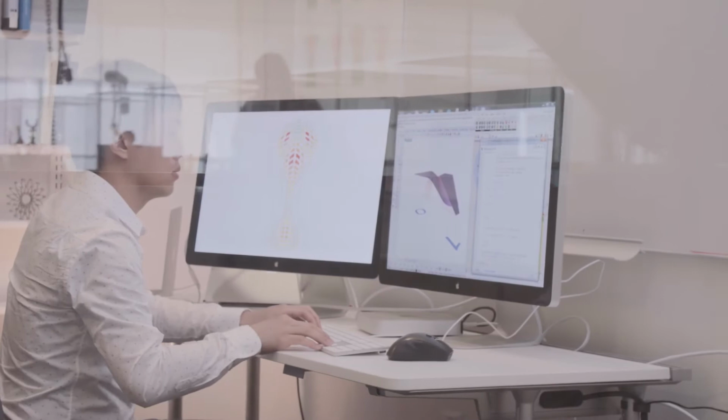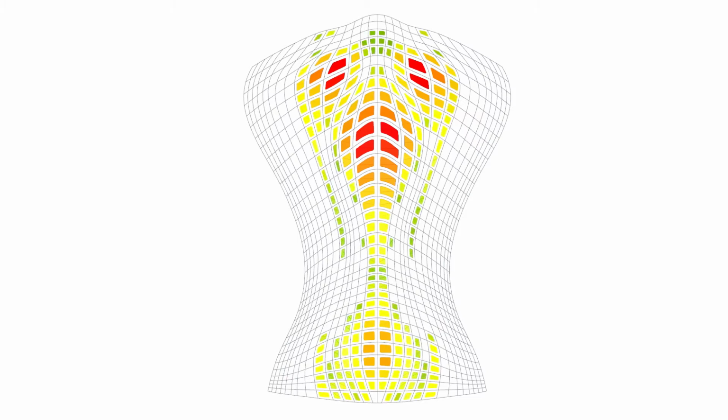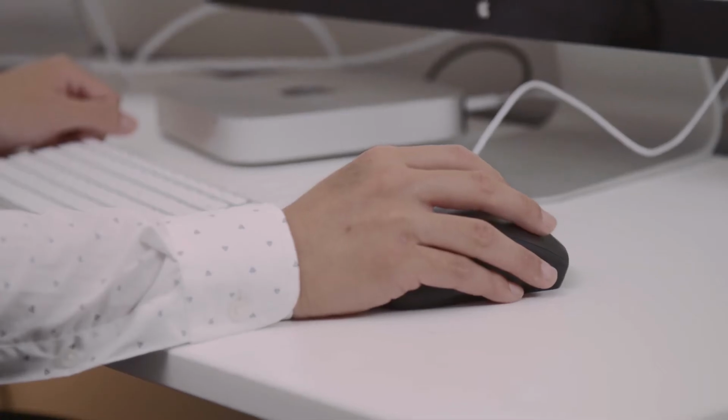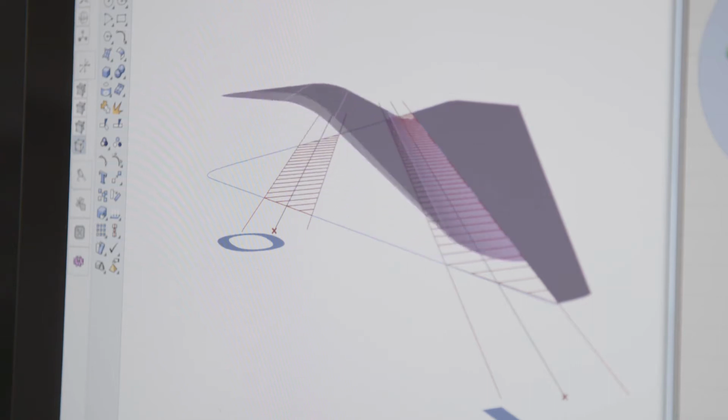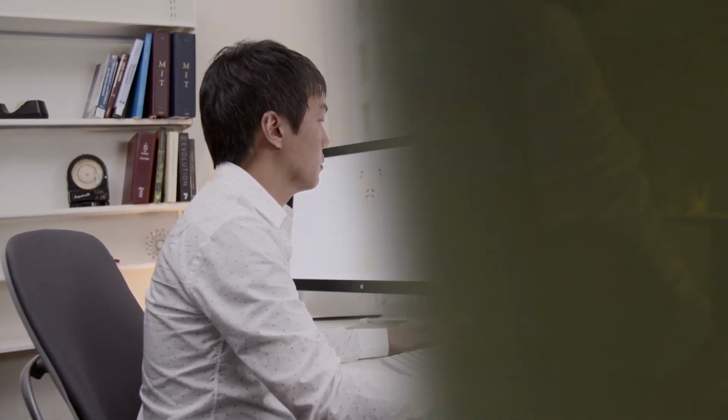In this project, we are trying to create an interactive feedback loop among human body, biofilm, and the environment. During the research process, we always need to modify the material properties based on our experimental data. And we have to use these properties to explore all the design possibilities of our biofilm. Therefore, we build a design interface which can not only simulate material behavior, but more importantly, give the designers a real-time feedback, creating a seamless connection from experiment to design to fabrication.